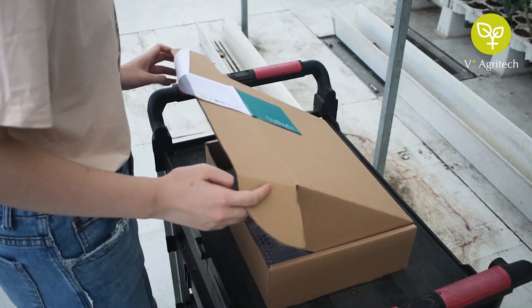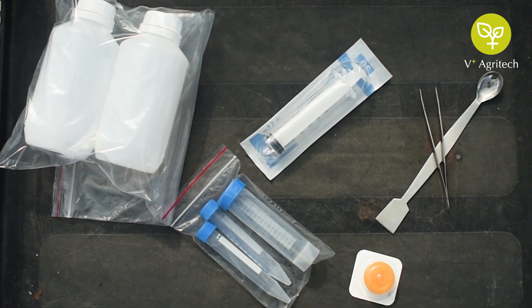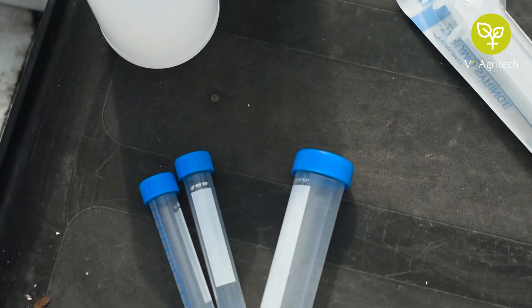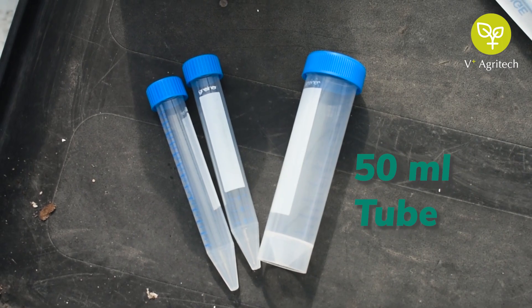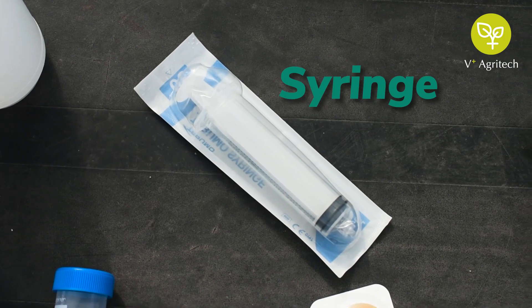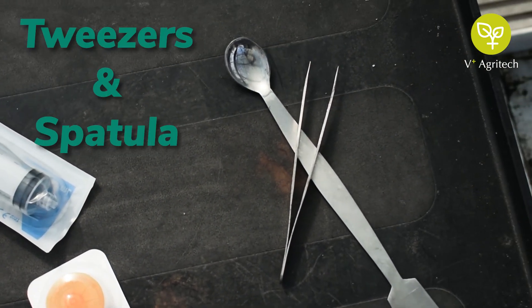After opening the package, you will find the following items for sampling: two 500ml water bottles, one 50ml tube, two 15ml tubes, syringe and syringe filter, tweezers and spatula.